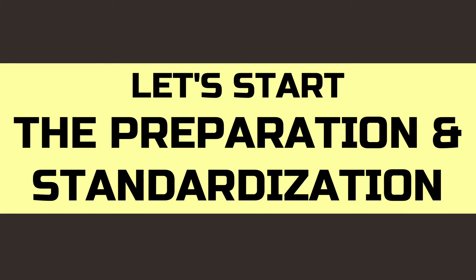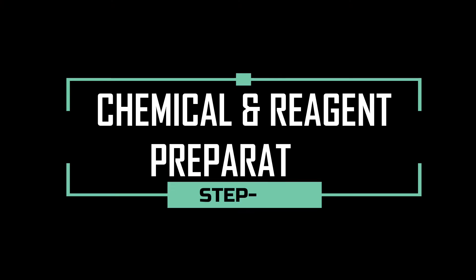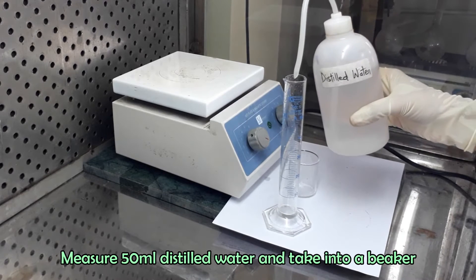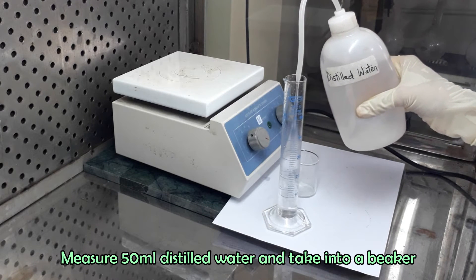Let's start the preparation and standardization of sodium thiosulfate solution. At first, we will prepare chemical and reagent. For the preparation of 1% starch solution, take 50 ml distilled water in a beaker and boil on hot plate.